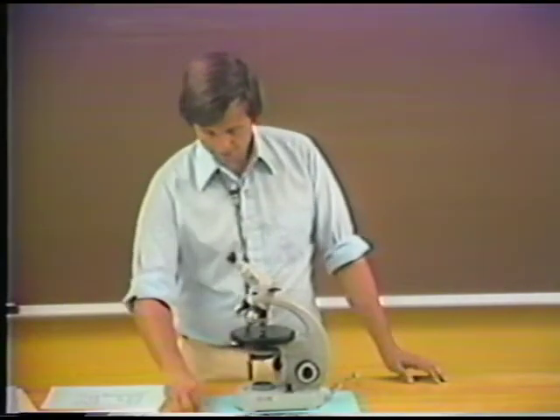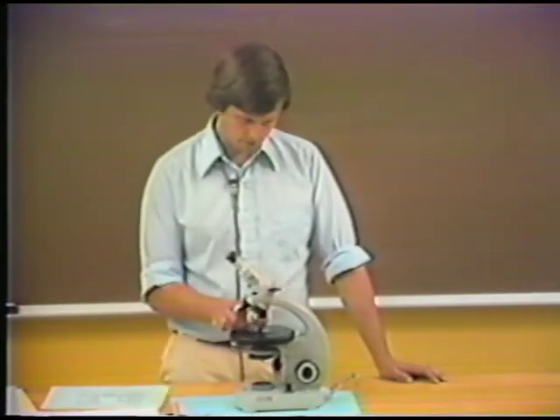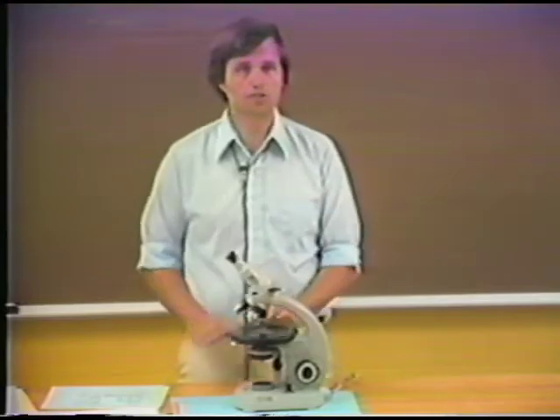We can also get the sign from a flash figure. So let me demonstrate this using a flash figure on the mineral quartz. So we'll look at this flash figure. And you can see, if you watch this flash figure, you can watch the departure of the isogyres from the field of view.